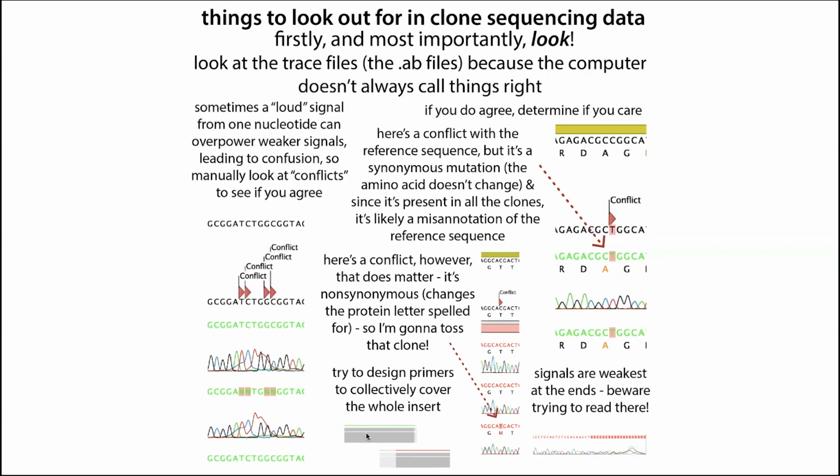And if there's a sequence that is in the unreliable zone, you definitely want to make it so that you have a primer that is going to cover that region of interest. So start like 60 or so before that region that you really, really care about.